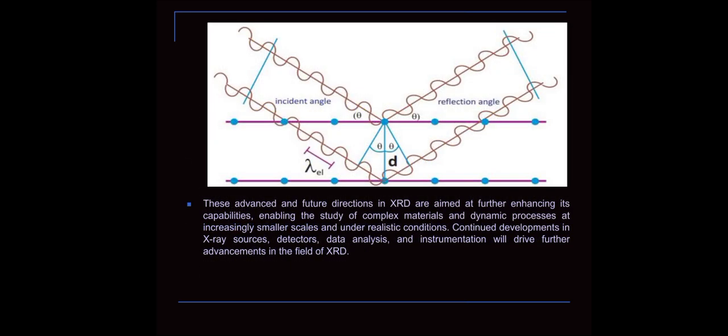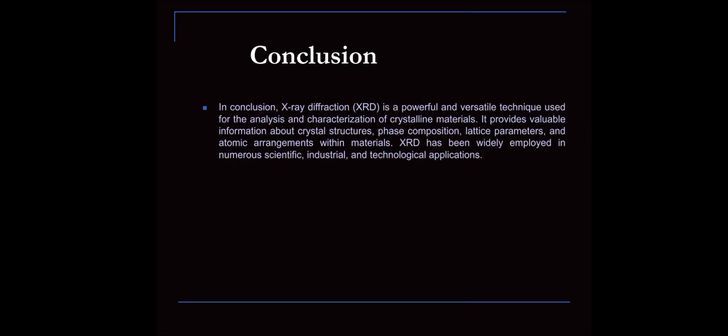This is a diagram. These advanced and future directions in XRD are aimed at further enhancing its capabilities, enhancing the study of complex materials and dynamic processes at increasingly smaller scales and under realistic operating conditions. Continued development in X-ray sources, detectors, data analysis, and instrumentation will drive further advancement in the field of XRD. Now I define the final conclusion of XRD.